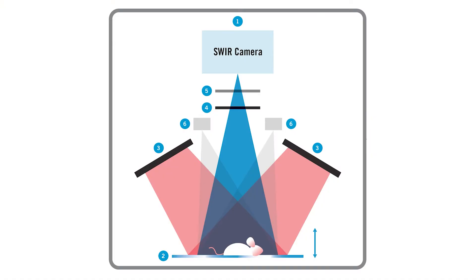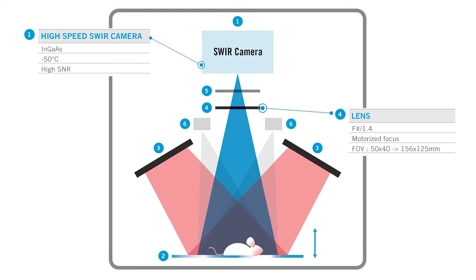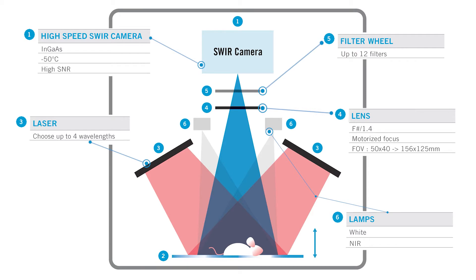Basically the system is an infrared camera with some optics, an illumination module, a filter wheel and a motorized stage to put the animal in a light tight box.